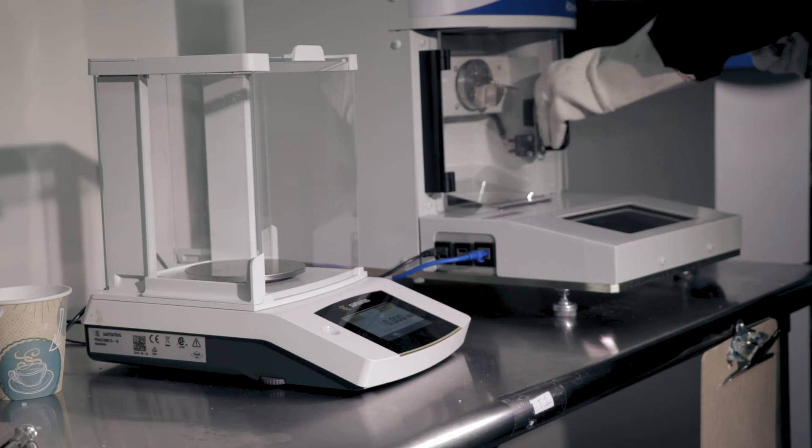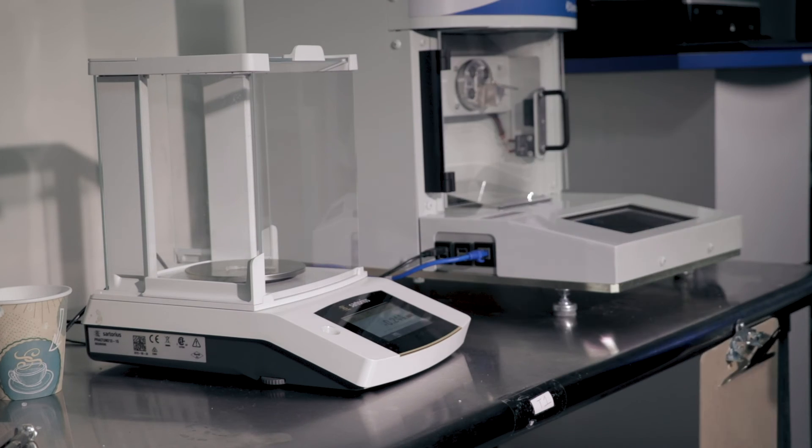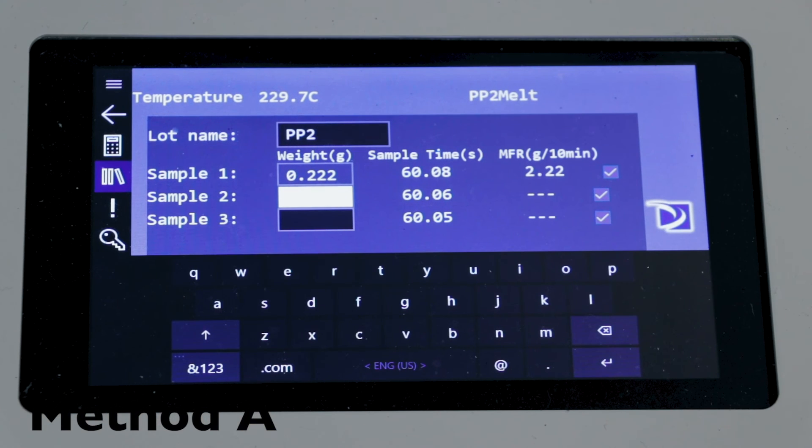The sample is placed on the scale to capture the actual weight in grams to the third decimal point. Enter the weight into the user interface and press the advance button to observe the calculated melt flow rate. The weight of the sample has been divided by the cut time.